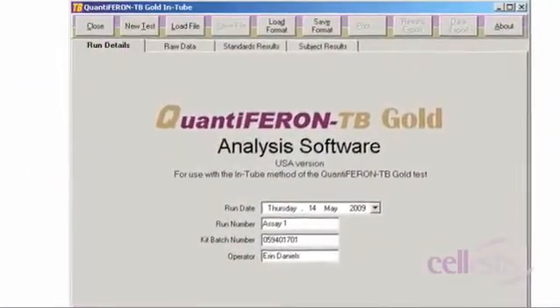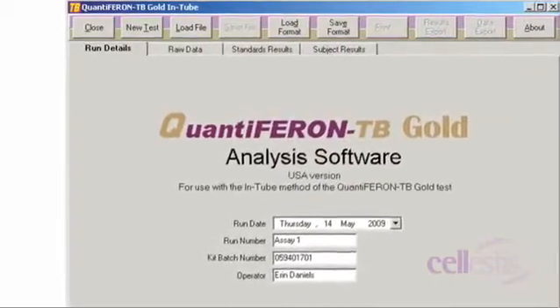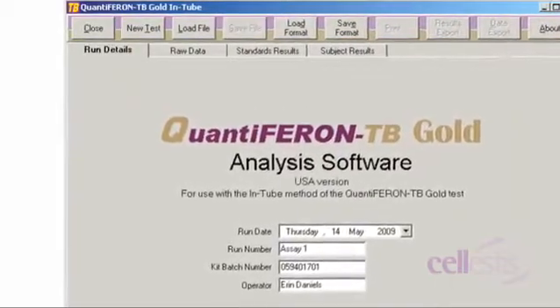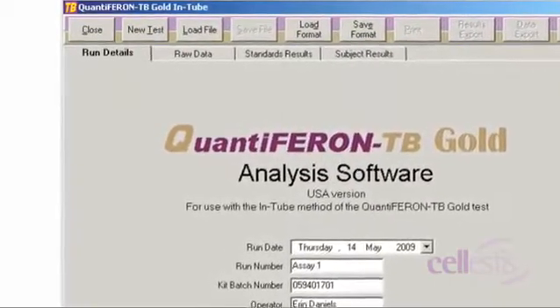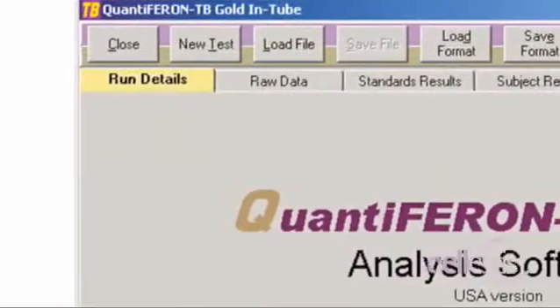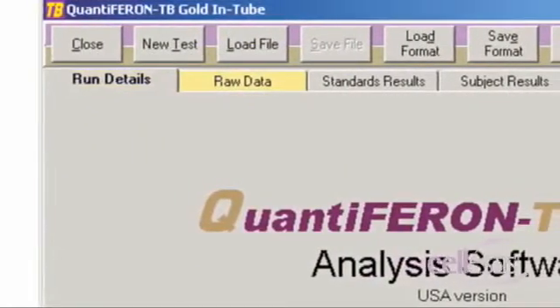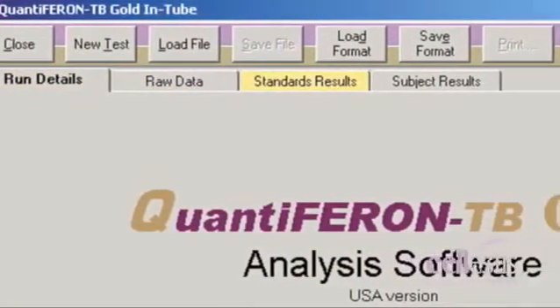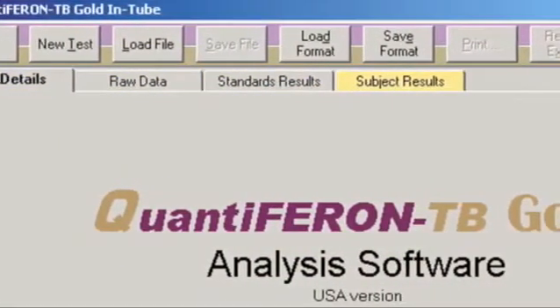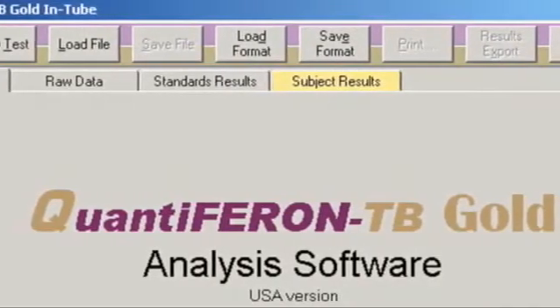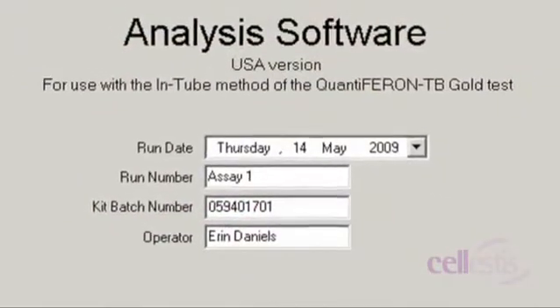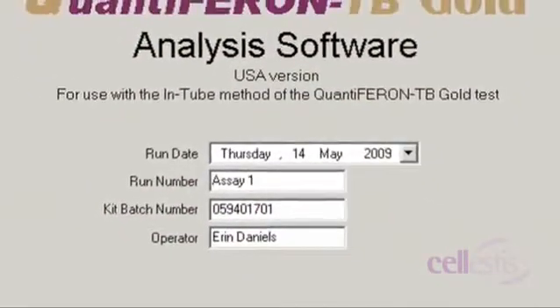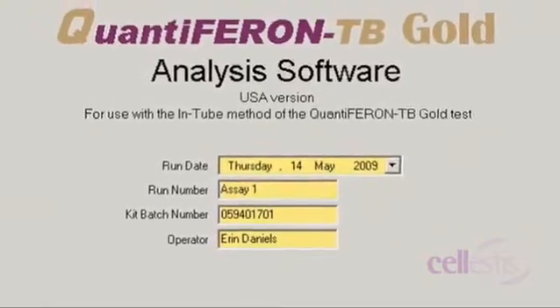The main screen shows four tabs that sequentially guide the user through the calculations. These are Run Details, Raw Data, Standards Results and Subject Results. To begin analyzing results, complete information in the Run Details tab.